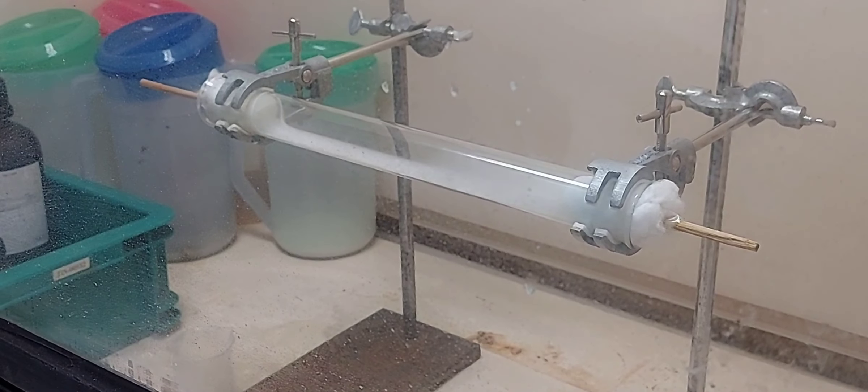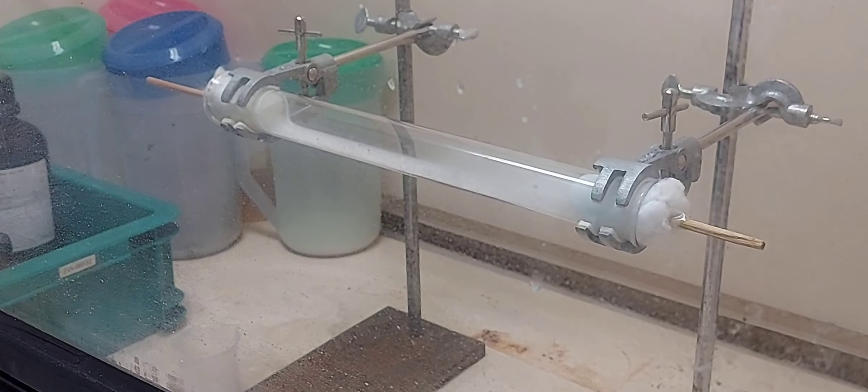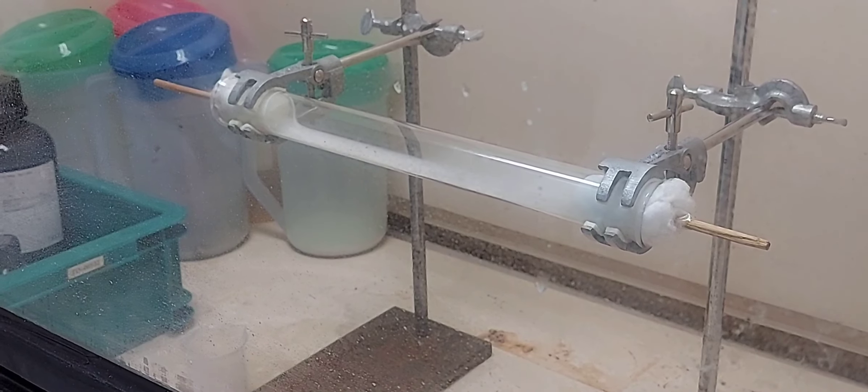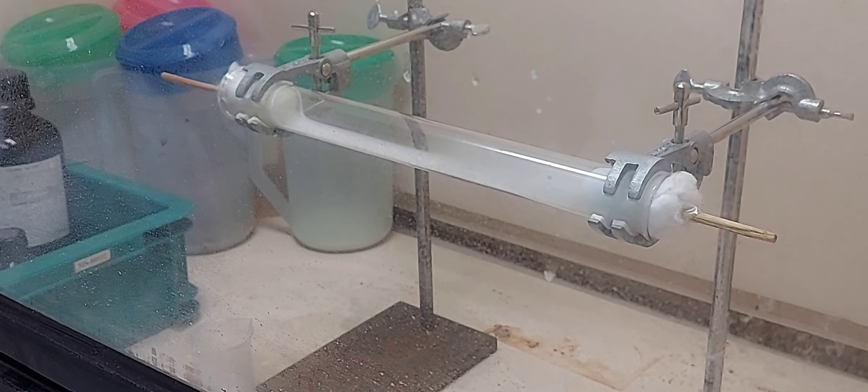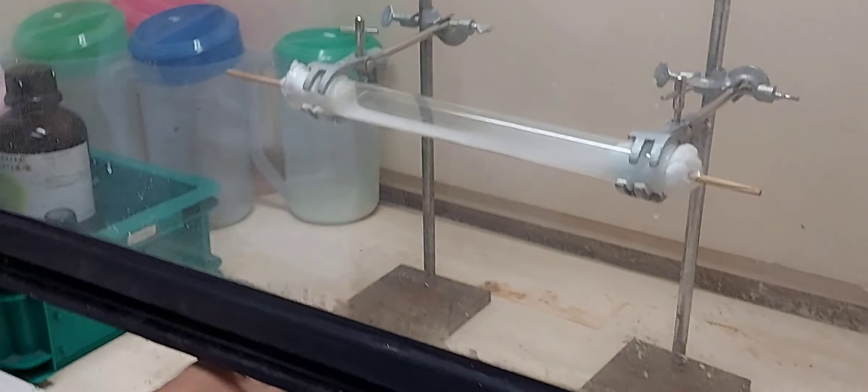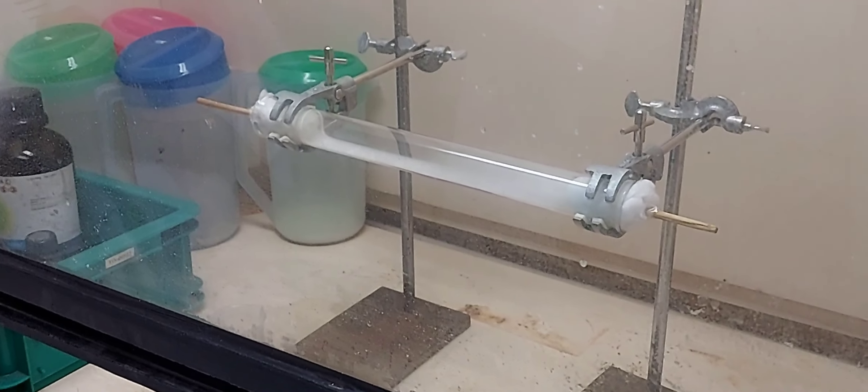So the white solid that you are seeing is ammonium chloride being formed. So which gases travel faster? The white fume, the white substance that you are seeing is actually ammonium chloride. So where did you see ammonium chloride first?